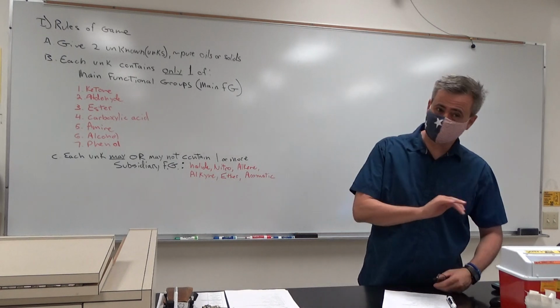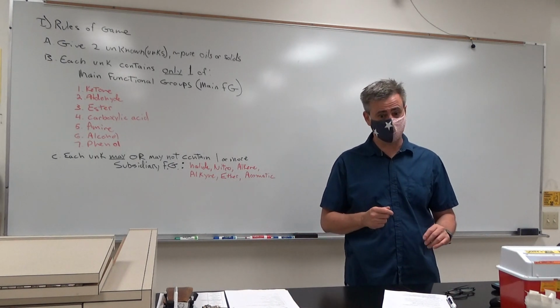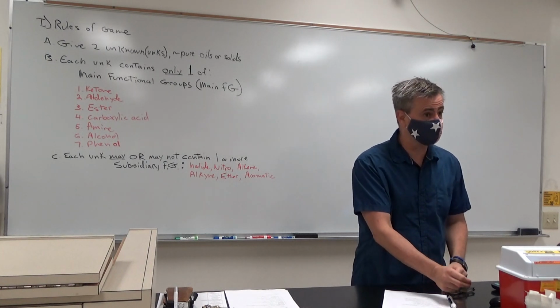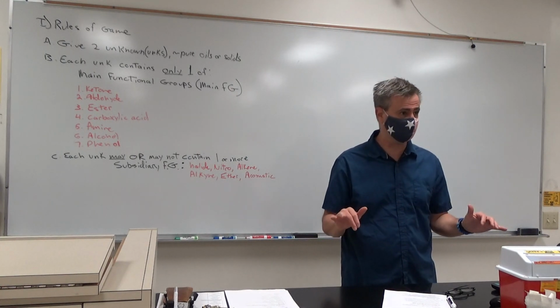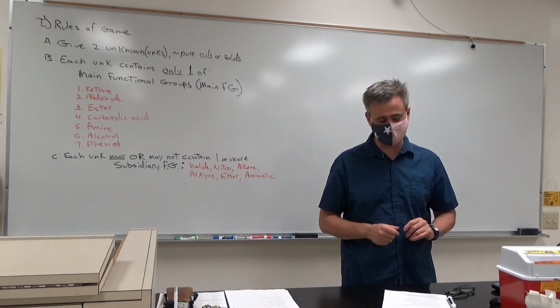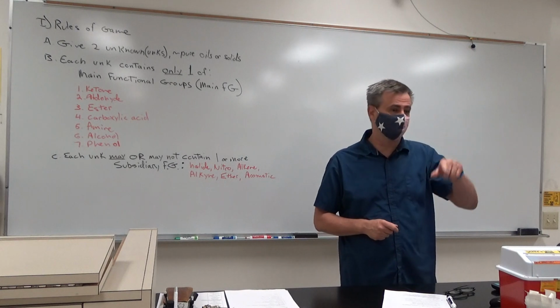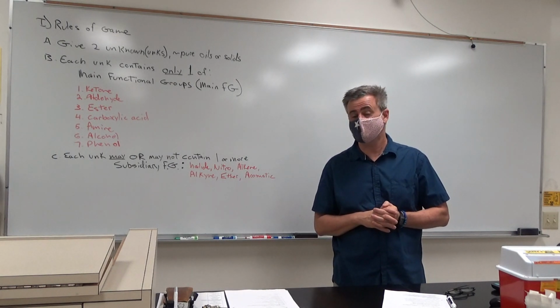Smell. Some of these, by the way, are very stinky. So you want to do the wafting thing. You want to keep it in a beaker so that you don't accidentally spill it and ruin this lab for the next 4 weeks. That's happened. And if you've got a super stinker, maybe try to open it in the hood. Be a good friend to your lab mates.